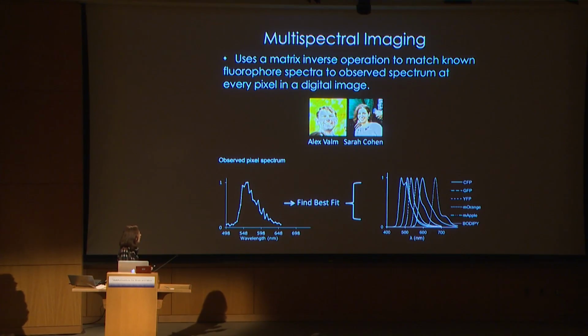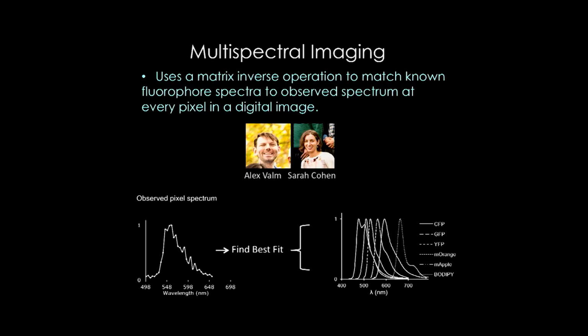So to overcome that challenge, 2 postdocs in the lab decided to employ a technology called multispectral imaging to try to unravel this overlapping emission spectrum.